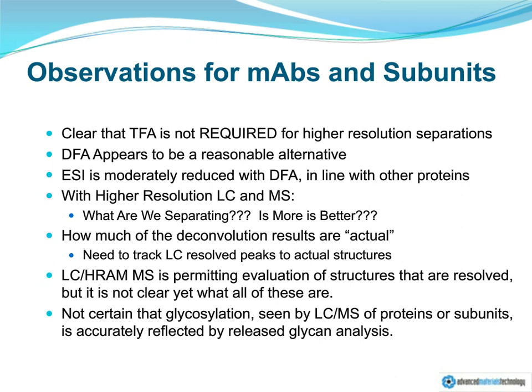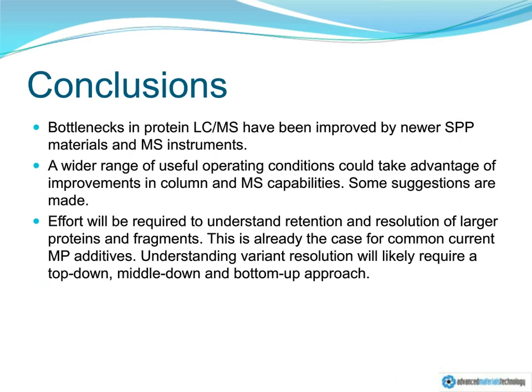And overall, to conclude, some of the bottlenecks in protein LCMS have been improved with newer superficially porous materials, and we've shown examples of that. There are a wider range of other operational conditions that you can take advantage of and combine with these higher resolution superficially porous materials to overall increase protein separation capabilities.